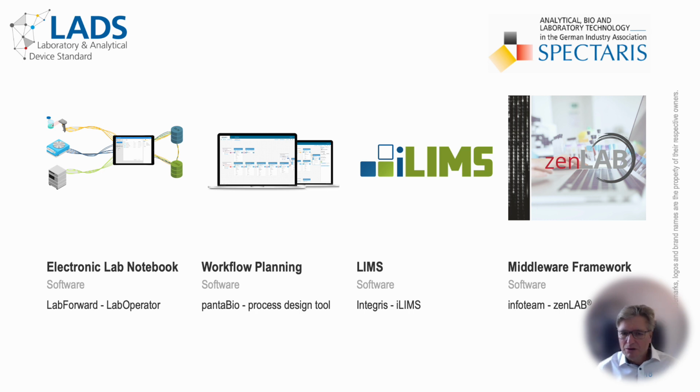The picture would not be complete without introducing some application software capable of supporting LADS OPC UA enabled devices in a plug-and-play fashion. We are delighted that the companies shown on this slide are returning participants of our LADS hackathons, implementing generic LADS OPC UA clients into their applications. Let's start from left to right.